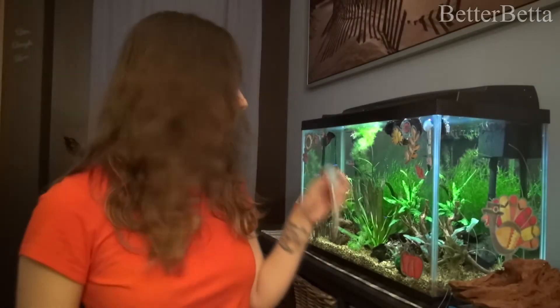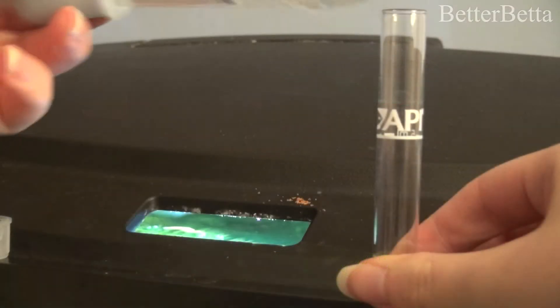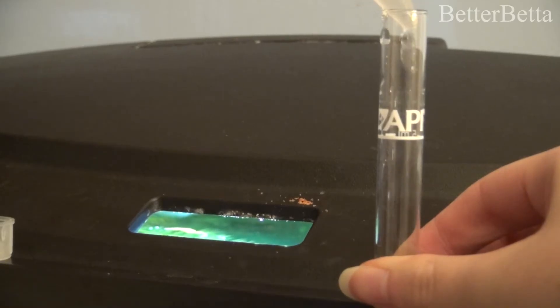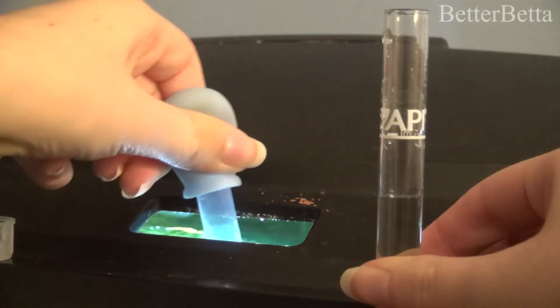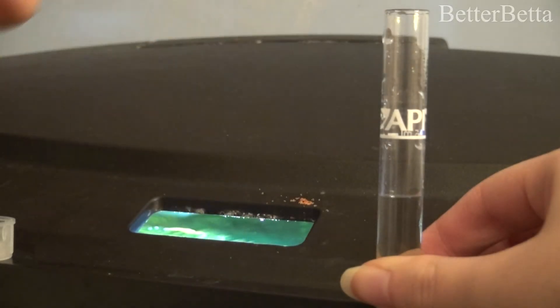So the first thing that you're going to do is take the water from your aquarium and put it in the test tube. When you're putting the water in the test tube, no matter how you decide to do this — whether it's just scooping it out or using an eye dropper — you really want to make sure that you have the tube at eye level so you can accurately put the amount of water in there. You want to make sure that the bottom of the meniscus, which is that little dip in the level of water, is what is sitting at the fill line.